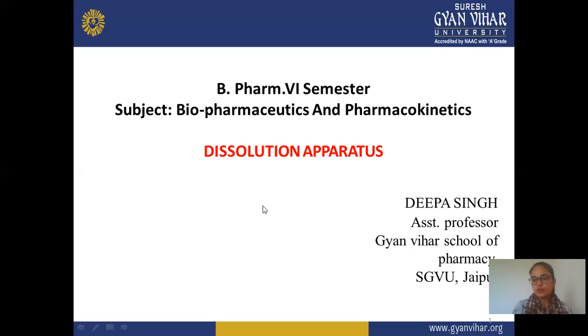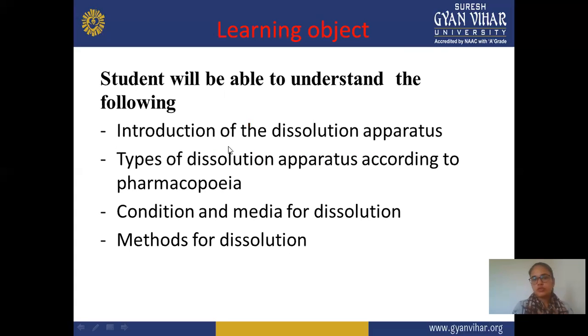This is a topic of Biopharmaceutics and Pharmacokinetics, a 6th semester subject. Before starting this topic, you should know the basic learning objectives. In these learning objectives is the introduction of dissolution apparatus, meaning the definition and the parts of the dissolution apparatus. What is a dissolution apparatus, how we perform the dissolution study with its help, and complete information regarding this dissolution apparatus.